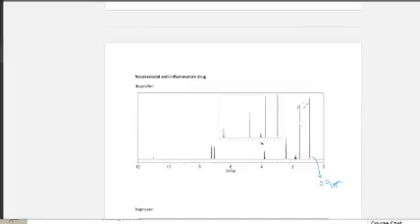This one right here is going to be around 1.7. And so in this case, what this could mean is that it could represent a CH2 around 1.7 or so. However, as we can see, our peaks are zoomed in. And so even though we have 2 peaks in the first 2 lines that we have drawn, it does not mean we have an integration of 2H. Rather, it is a doublet.